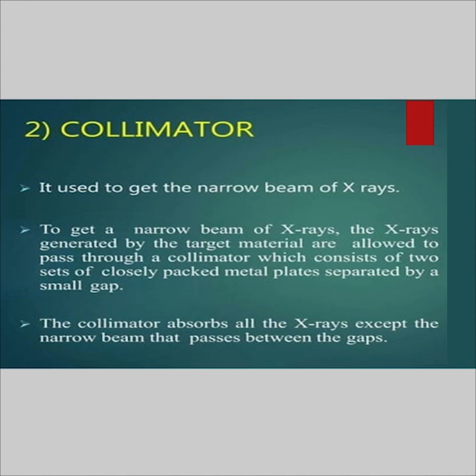Generally, the target gets very hot in use, so this problem has been solved to some extent by cooling the tube with water. So, we need to know what actually happens. If significantly energetic electrons are available, the transfer of energy from the electron beam may eject an electron from one of the inner levels or shells of the target atoms.